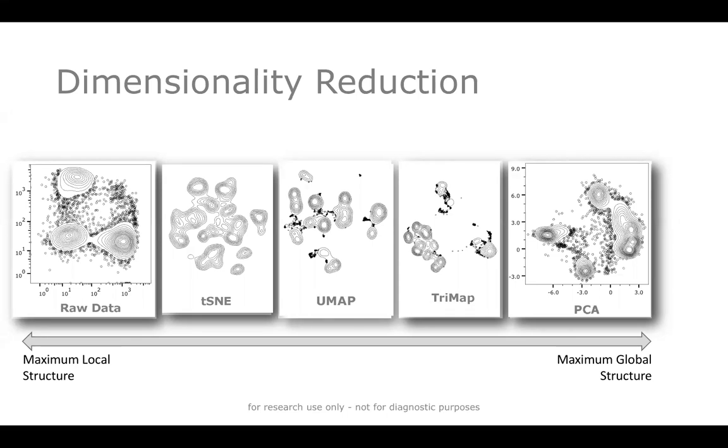As we begin to apply some machine learning to that raw data, we can look at hundreds, as many parameters as you like. We can look at thousands of different parameters all at once in a T-SNE map, which is going to give us a better picture of the local structure of the data. And we're going to be able to start to spot all the different subsets within those broader buckets that we can see in the raw data on the far left.